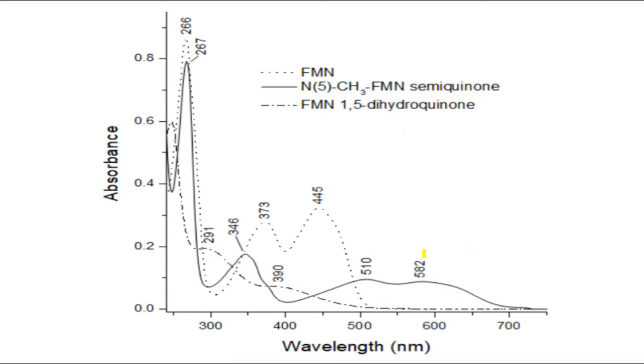This one is probably the most visible one. What this graph tells us is that I shone light at 700 nanometers. A nanometer is 10 to the minus 9 meters, meaning a billionth of a meter. Some radio waves can be about a meter, and this is a billionth of it. So we're talking about really very much varied.